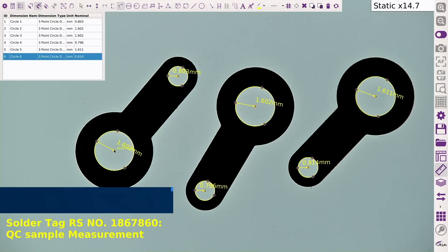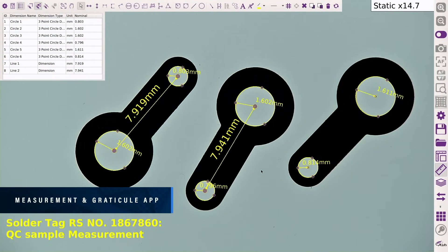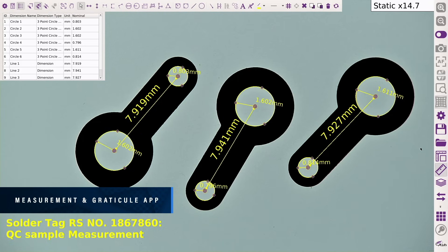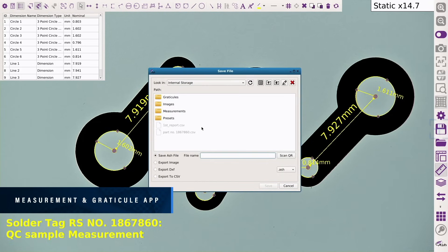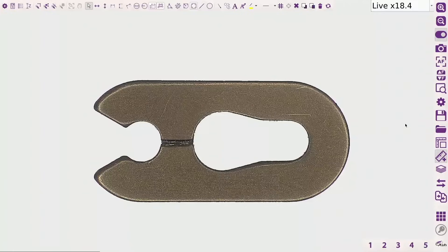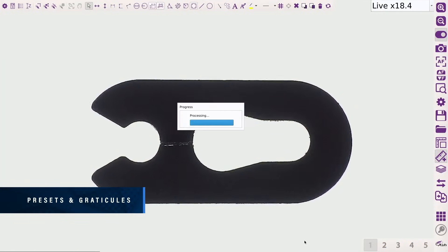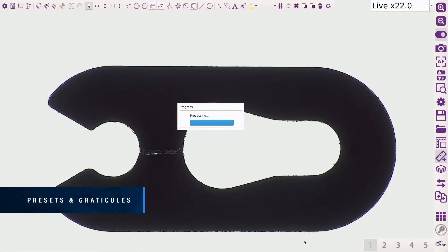Full suite of accurate measurement tools are available to efficiently carry out any measurement tasks. Annotations and graticules can be added to images for quick referencing. On-screen preset buttons allow quick access to pre-configured part-specific system settings.